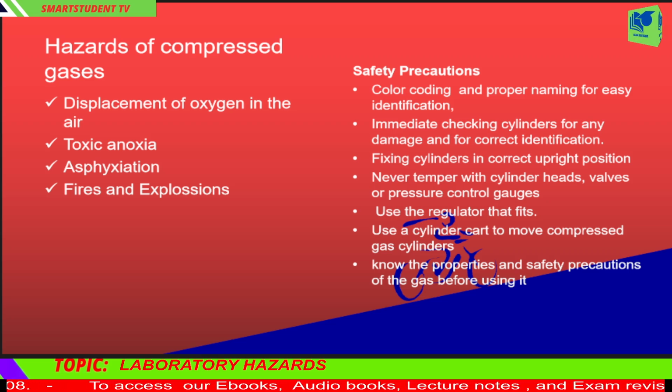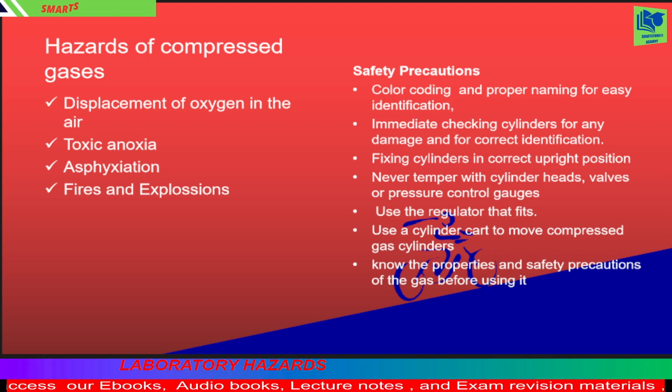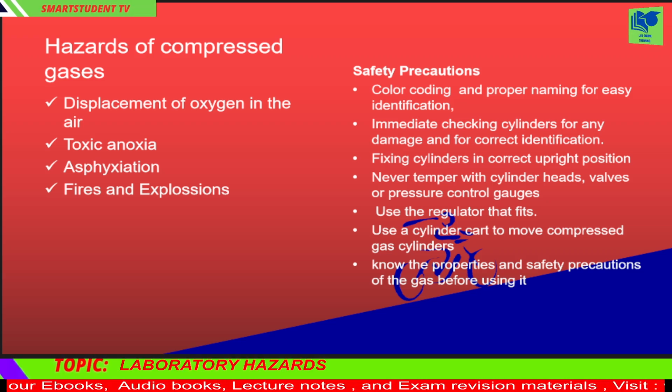11. Never deface or remove the product identification label on a cylinder. 12. Do not use unlabeled cylinders. 13. When you empty a cylinder, leave some positive pressure in the cylinder, close the valve, replace the cap, and mark the cylinder empty. 14. Cylinder status tags are very convenient for marking cylinders as full, in use, or empty. Use a piece of label tape, write empty on it, and place it on the cylinder.